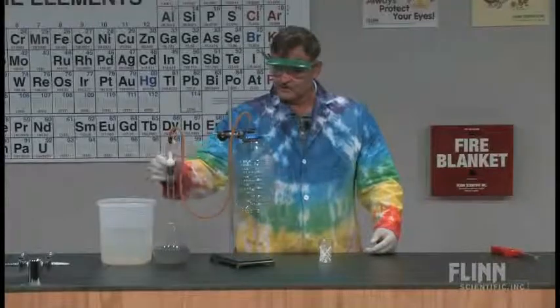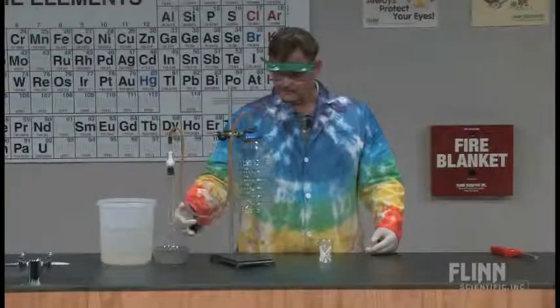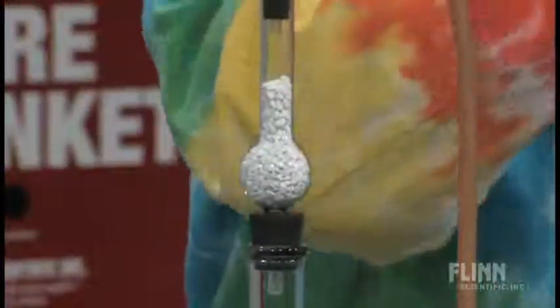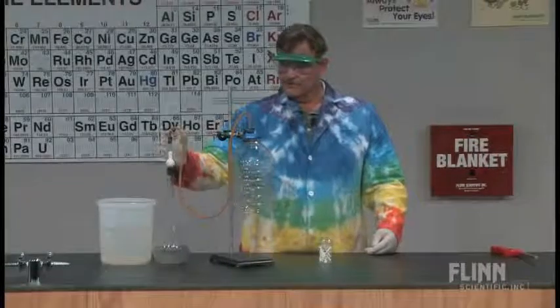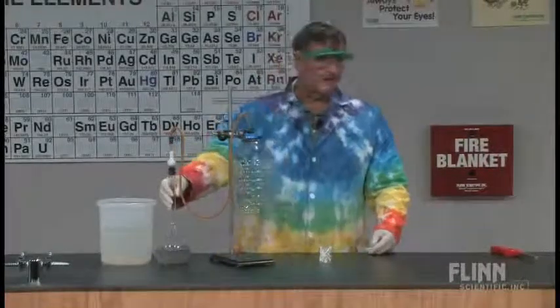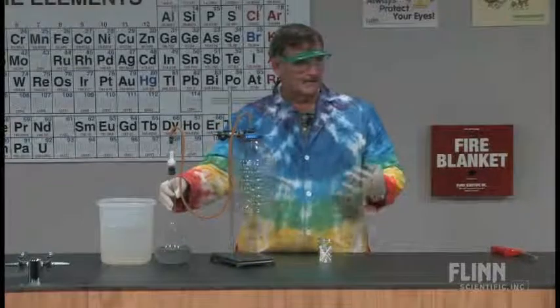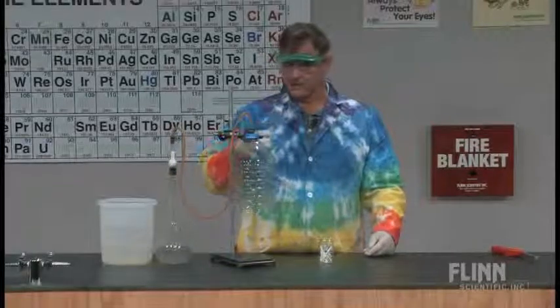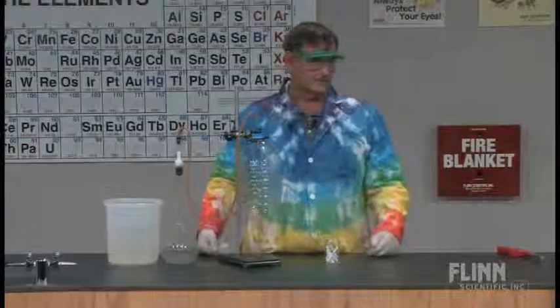There's also a calcium chloride drying tube here, so any excess water vapor that gets bubbled up gets passed through it, and I can actually get dry hydrogen pretty easily this way. When I'm doing it with my students, I don't worry about the calcium chloride drying tube because I've done it so many times it doesn't seem to make a difference. That's an option you have as a demonstrator to decide which direction you want to go.